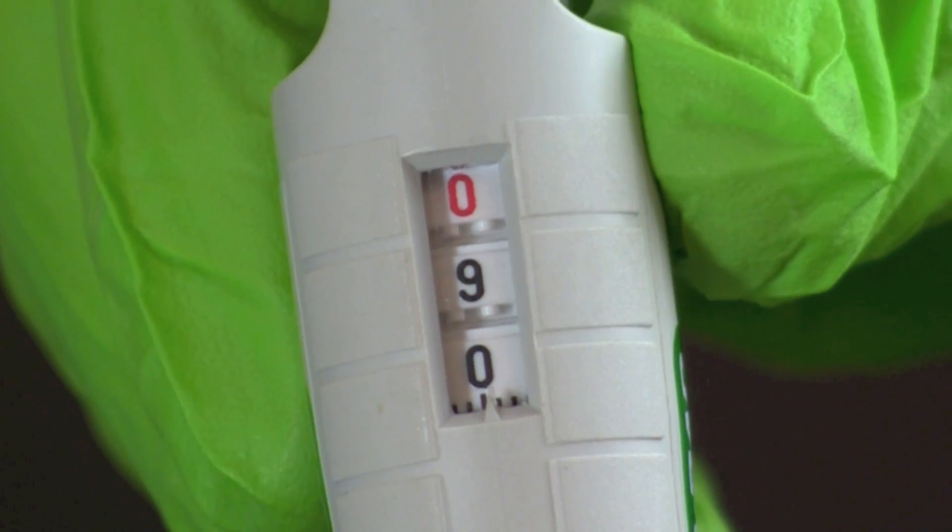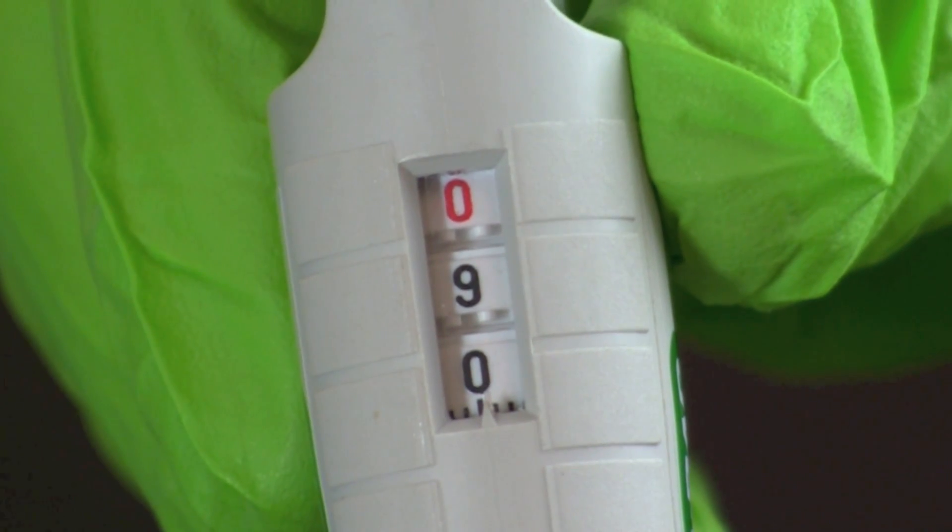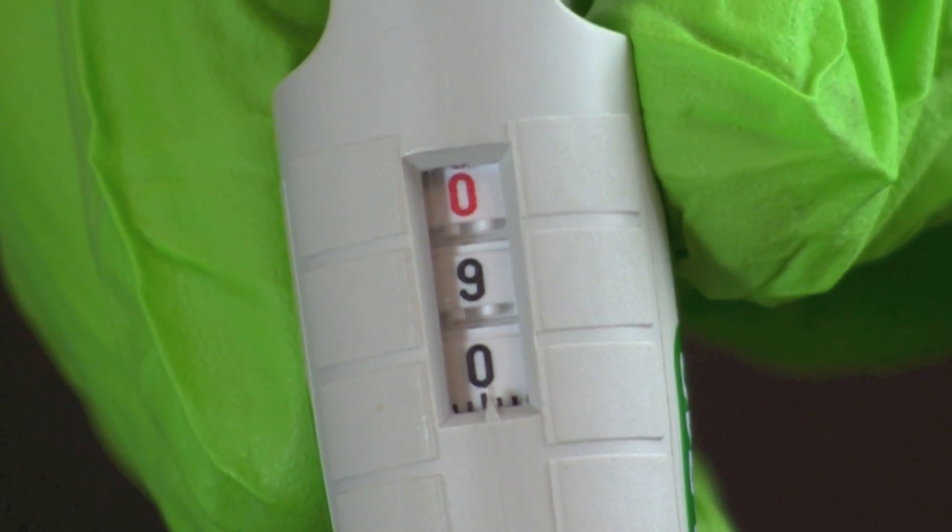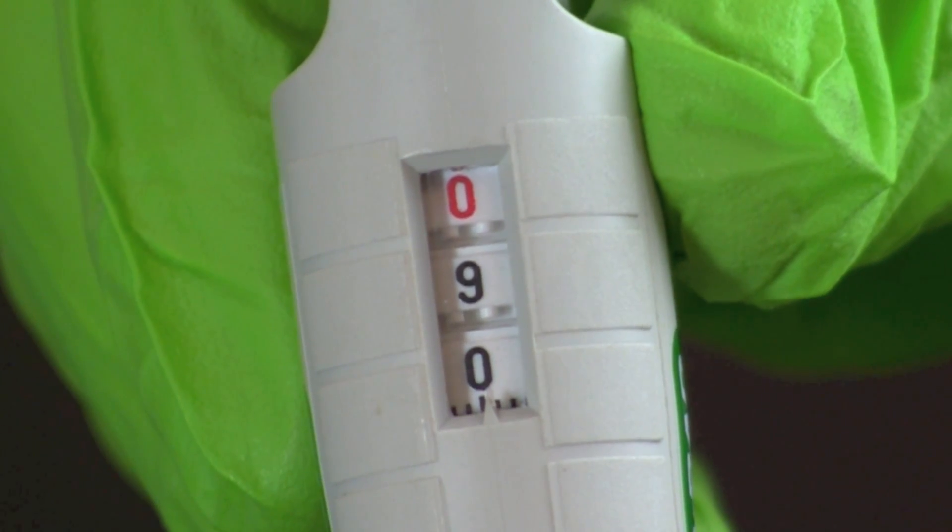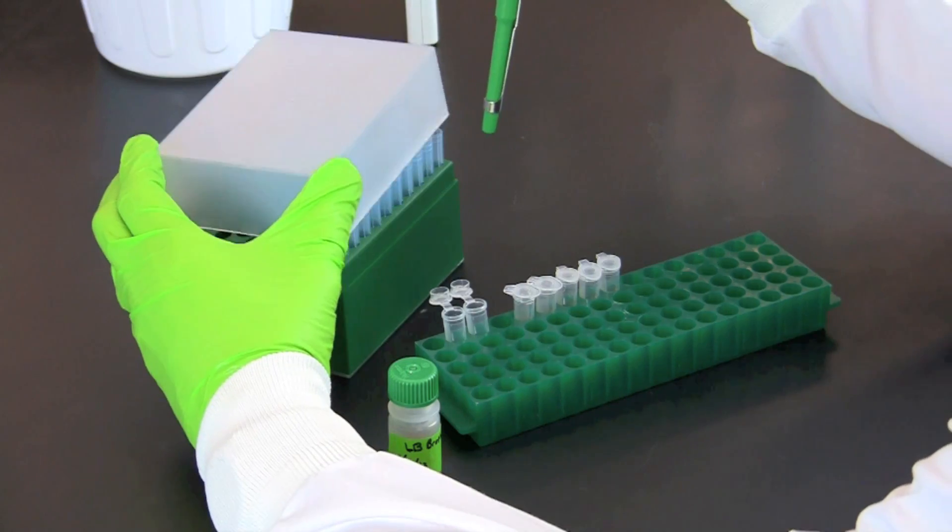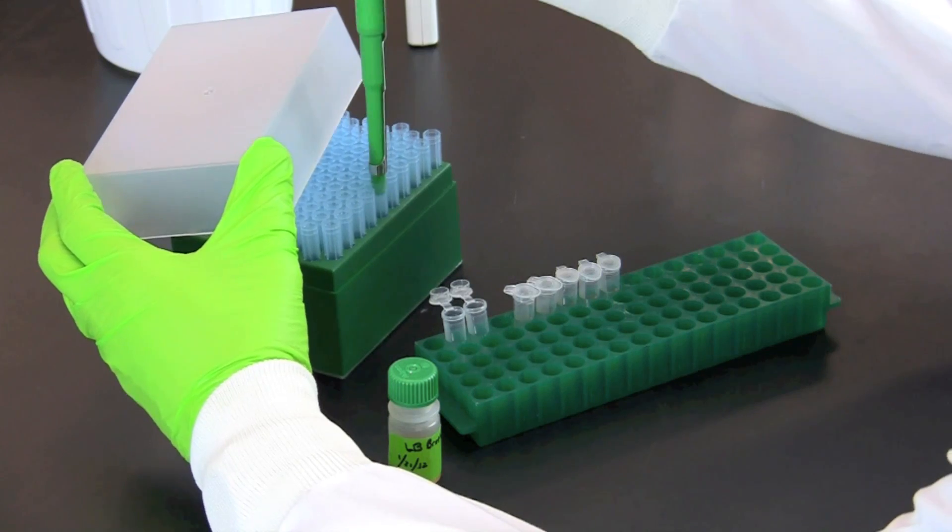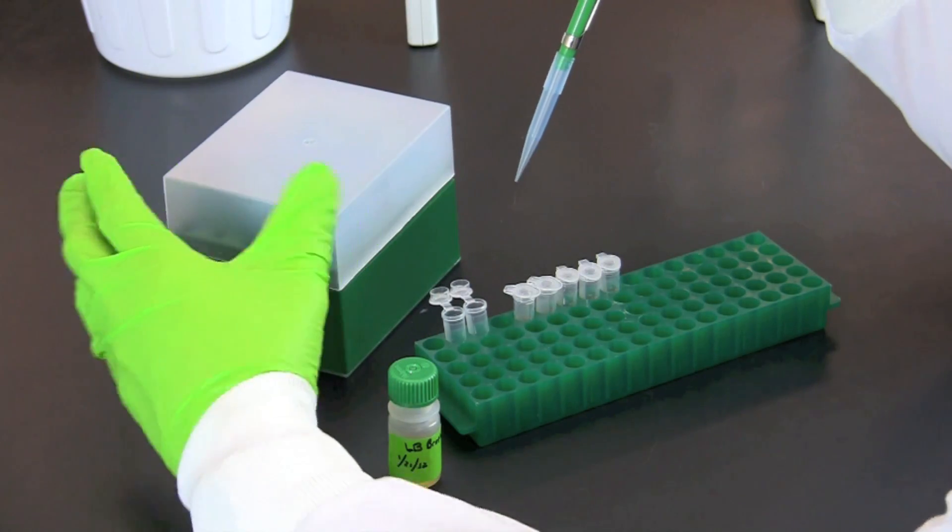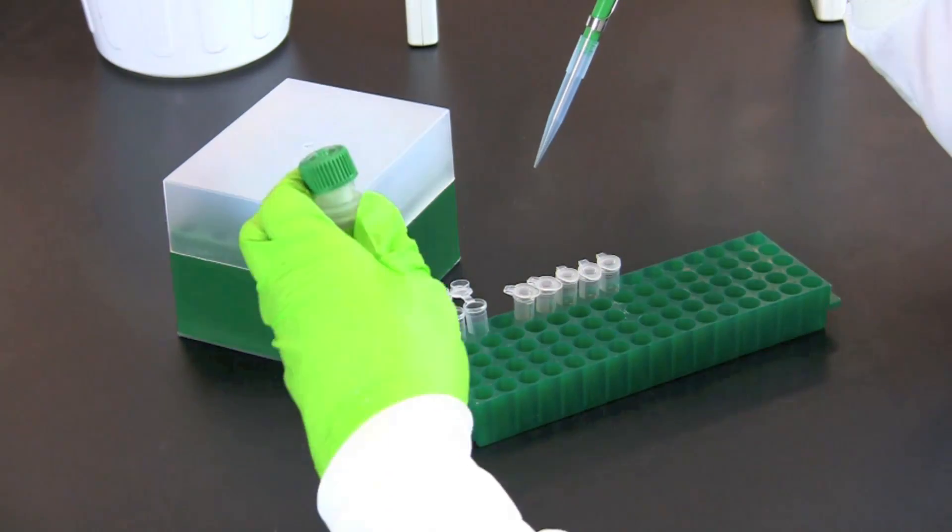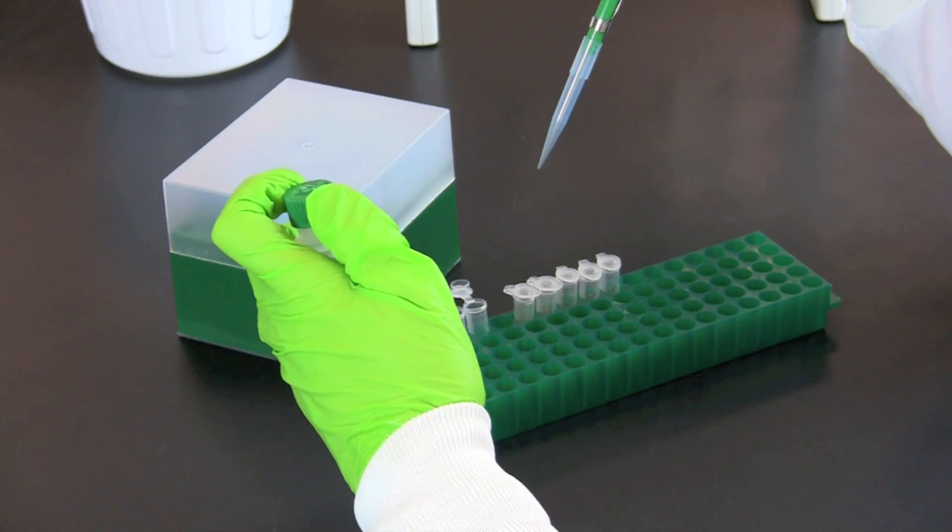Using a 100 to 1000 microliter micropipette, set the volume to 900 microliters. Using aseptic technique, pipette 900 microliters of LB broth into each microcentrifuge tube.